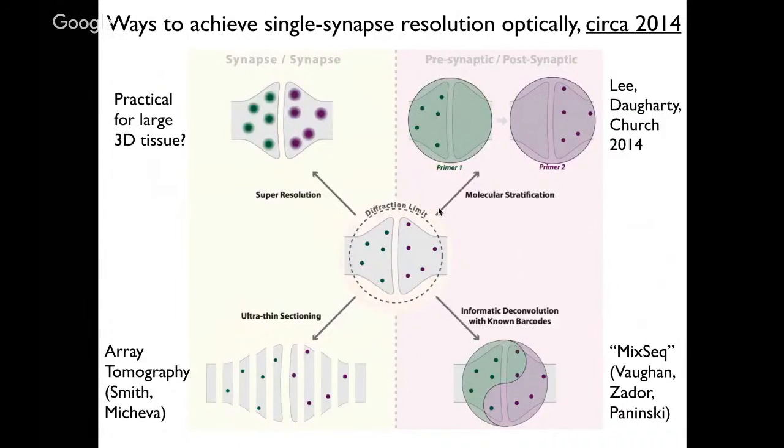There were certain existing super resolution microscopy approaches that could be applied. Some of them involve looking at the stochastic blinking of single molecules, kind of sparsifying the sample so that most of the molecules are off, and you can turn a subset of them on and try to find the centers, and then stitch the image back together by localizing the centroids of certain dots. Another idea that came up early in the work around in situ sequencing was maybe there are other ways to sparsify the image, so you wouldn't be looking at everything at once.